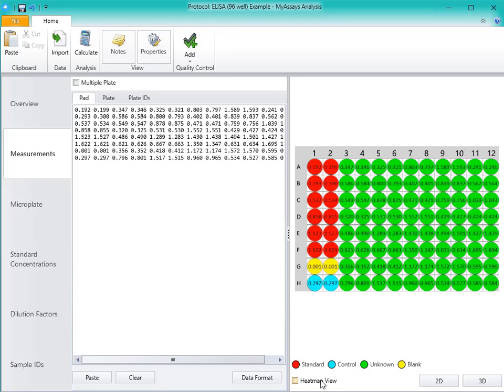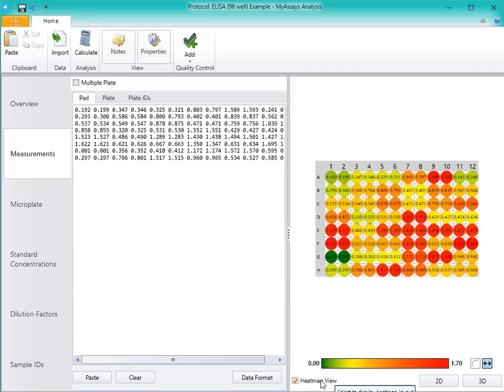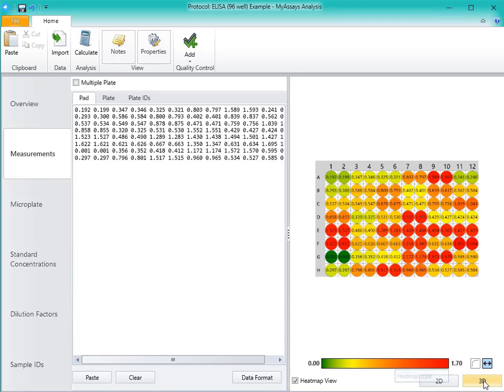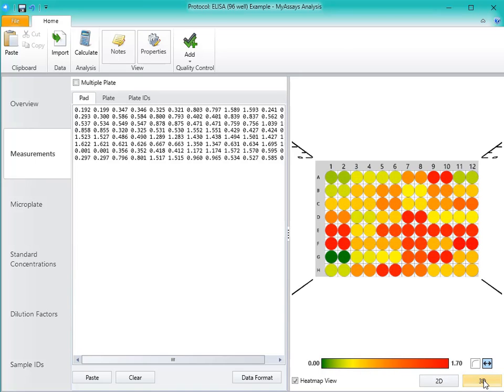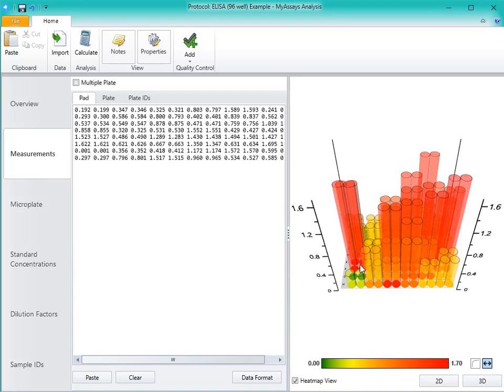The heat map colors the cells based on their results, with red corresponding to higher raw results and green corresponding to lower raw results. You can also view this information in 3D by toggling between these buttons. Click and drag on the screen to rotate the view.